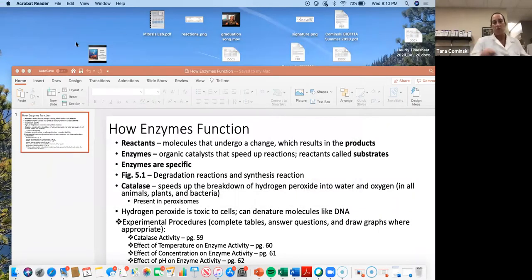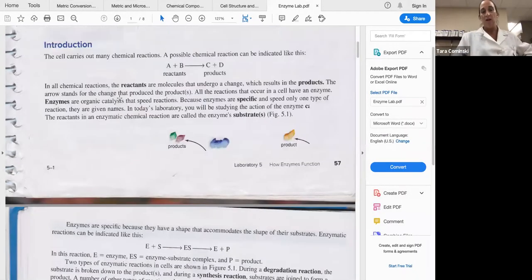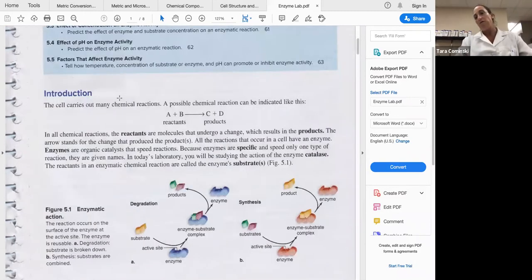be a PDF that you guys will have to follow, and you should be following along as I go through this demo. I will talk about the background information just using my one PowerPoint slide. That PowerPoint slide is also going to be on Moodle as well, okay?